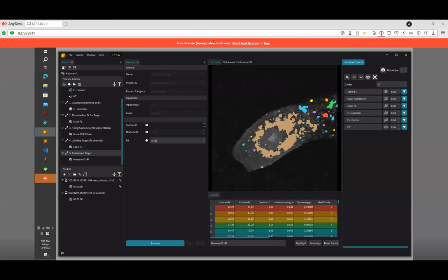Okay, so as the second part, I want to show how the TomoAnalysis works in real life. This is the remote screen that I use for the analysis, and you can see the outlines of the screens. Briefly, if I explain the UI here, on the left side is the pipeline and how it works, and what outputs or inputs it uses. That information is listed here.